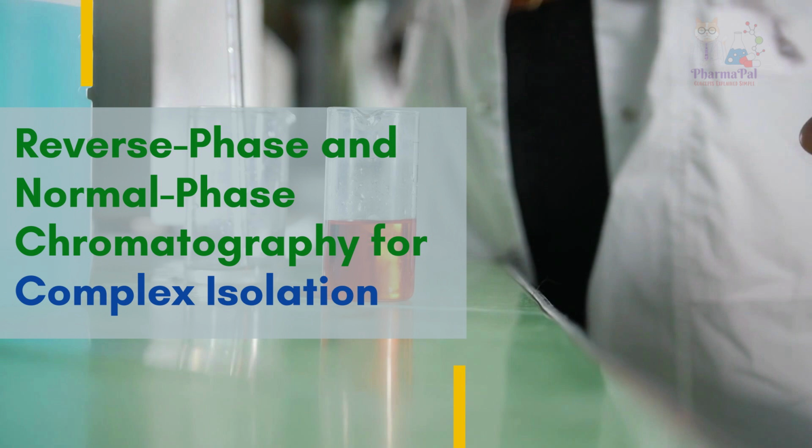1. Dissolve the tablet in an organic solvent. 2. Add water to create a biphasic system. 3. Separate the organic and aqueous layers. 4. Acidify the aqueous layer to separate caffeine and acetaminophen. 5. Extract acetaminophen into an organic solvent. 6. Use reverse phase and normal phase chromatography for further separation. 7. Recrystallize each compound for final purification.